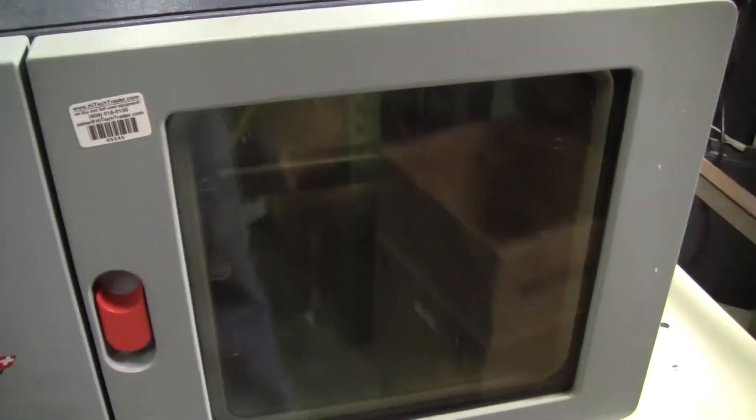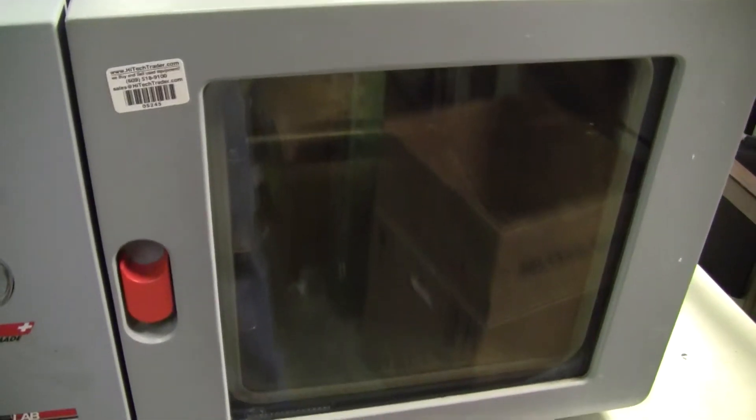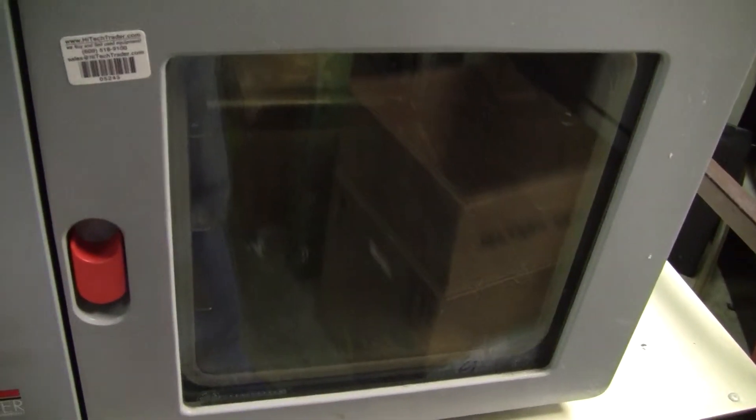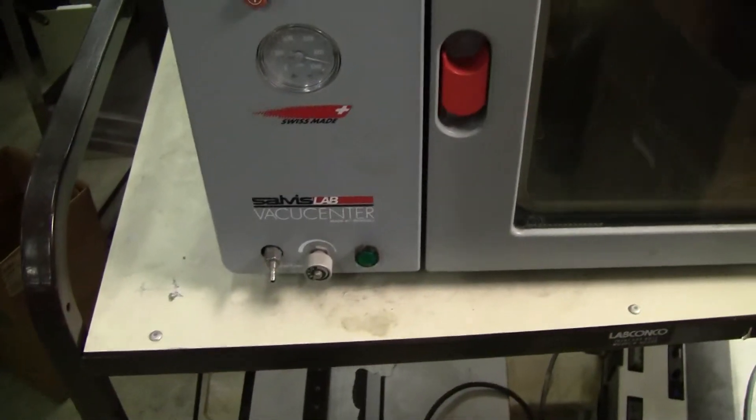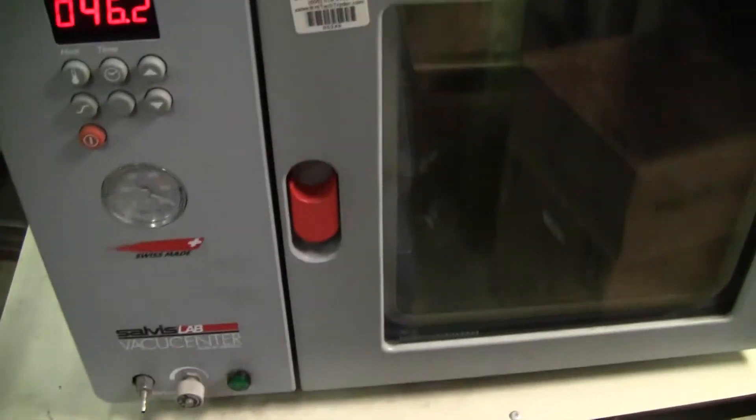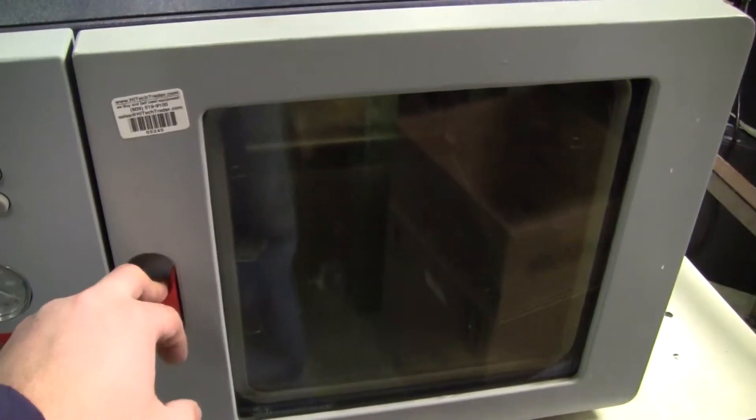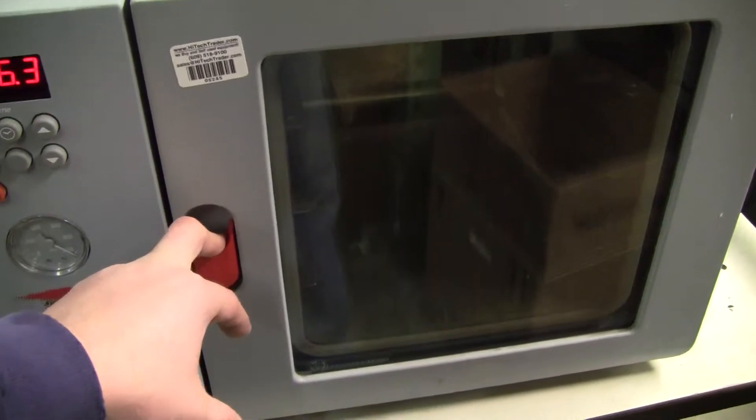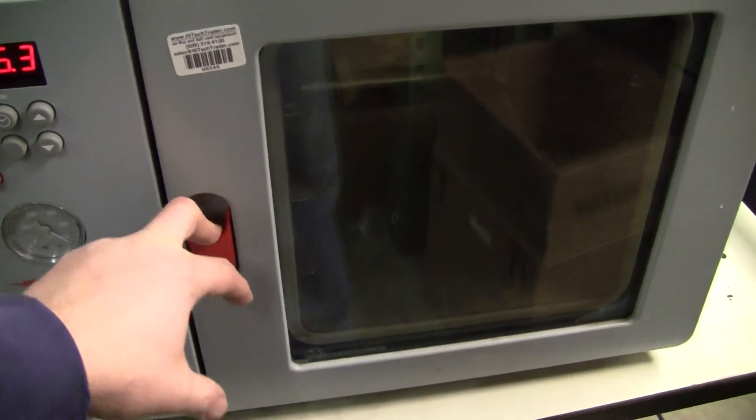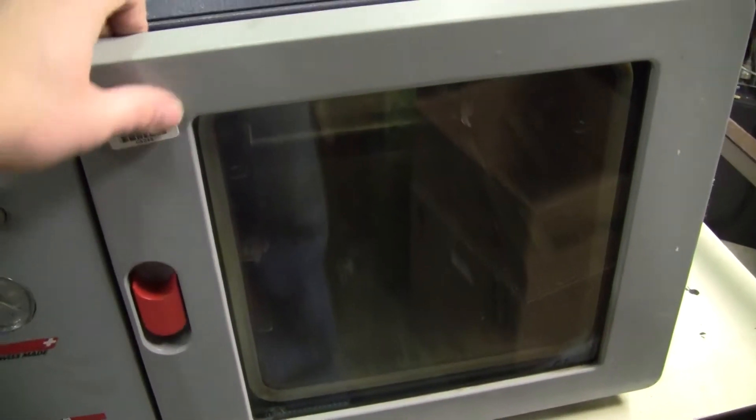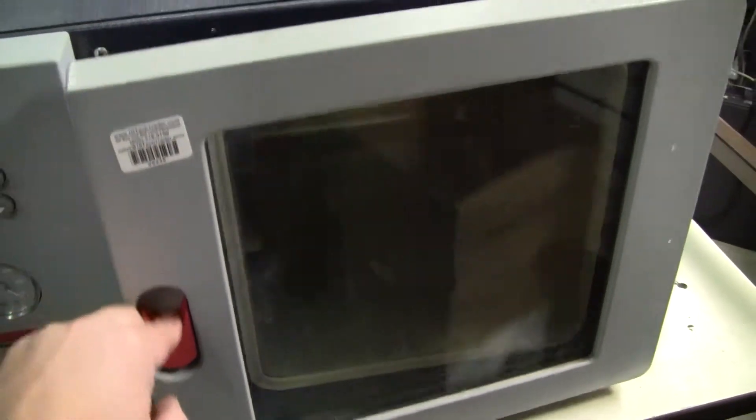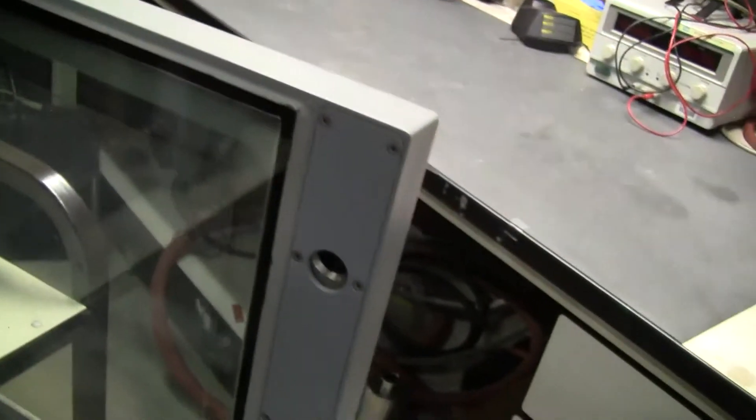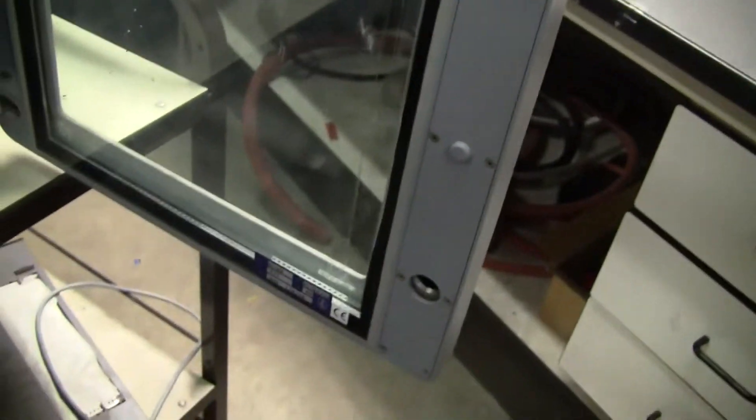Looks like just about one cubic foot on the interior of the vacuum oven. I do like the clamping mechanism. Looks very solid.